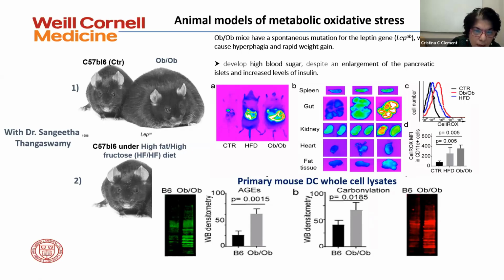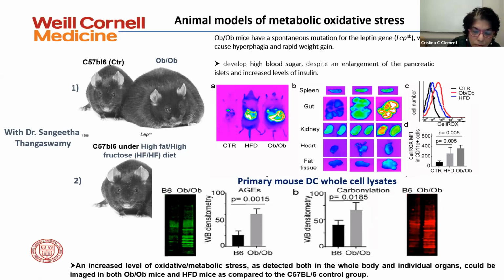So overall, we were able to consider that these mouse models were suitable for our interest to analyze the immunopeptidome and the late endosomal compartment processing of the antigen under oxidative stress conditions.